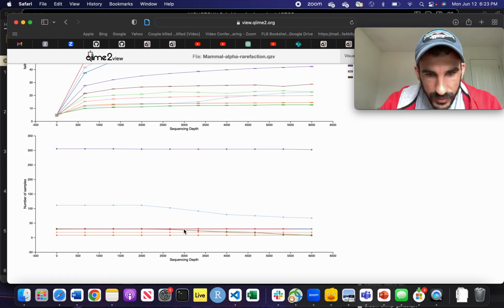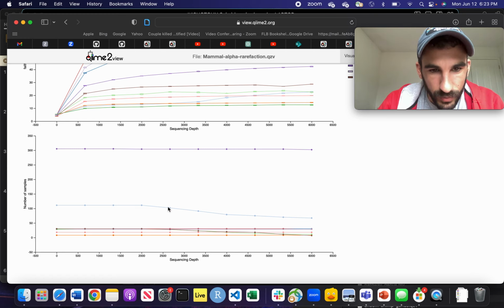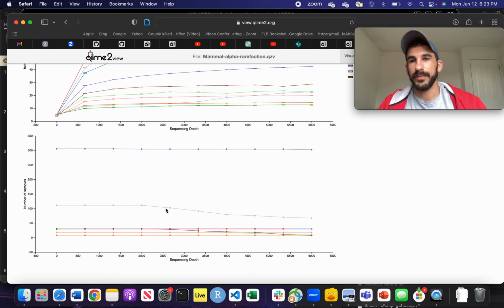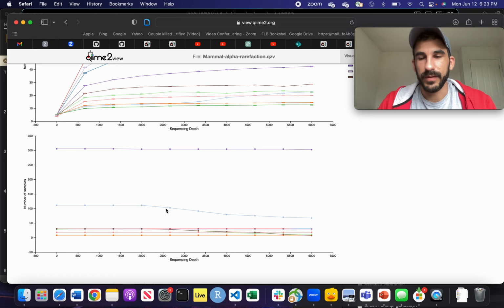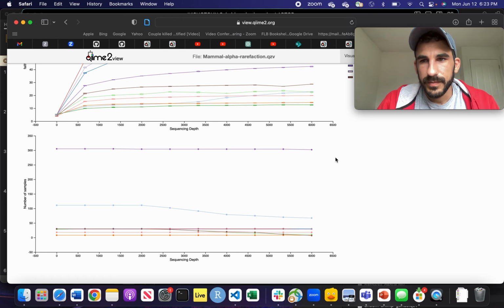I guess, there's this green line that goes from like 10 to 0. So that's problematic. So I guess we're going to go right here before everything looks to stay the same, and we only lose a couple of this light blue line. So I would go up to 2,500. So this is something you can obviously screenshot me and we can talk about as well. So yeah, this is how we use this plot.